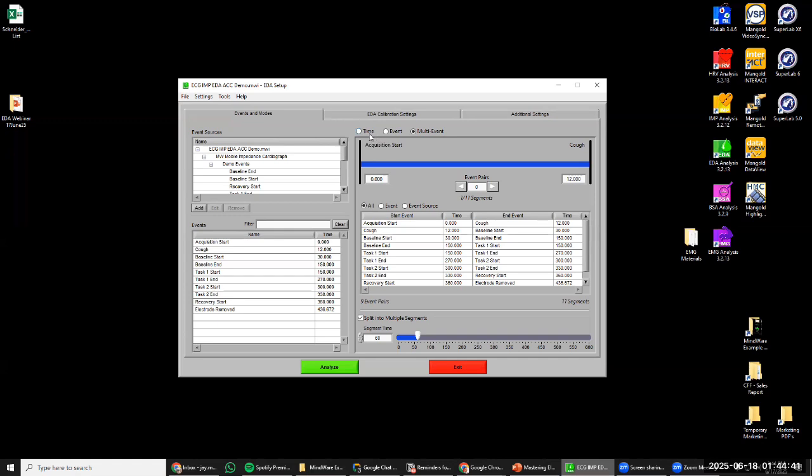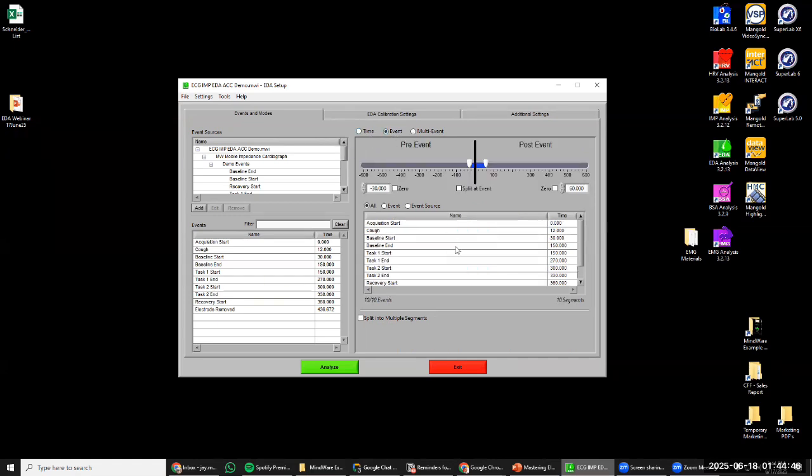So before we get into time mode, which is how we're going to look at most of this, there is an event function here, which isn't commonly used with our different analyses, but is somewhat more prominent for skin conductance. If we imagine that we have these different events, some of these are identifying different parts of the study, so starting the task and ending the task, and so forth. And some of these potentially could be just sort of behavioral in nature. These are events that we could be placing live, or they could be events that we're adding afterwards because we have a video that's synchronized.